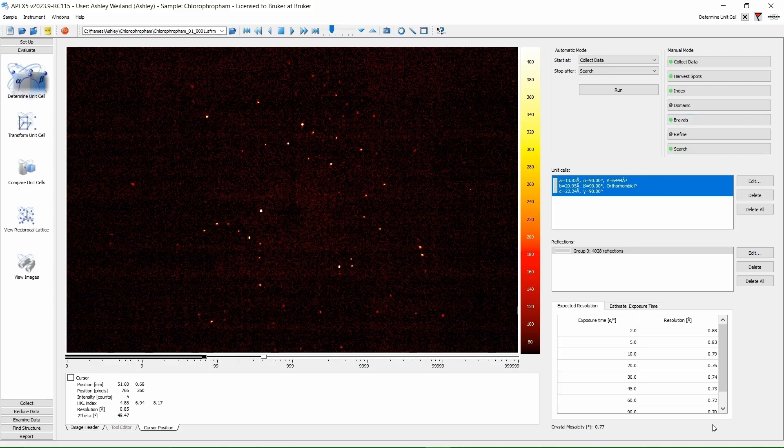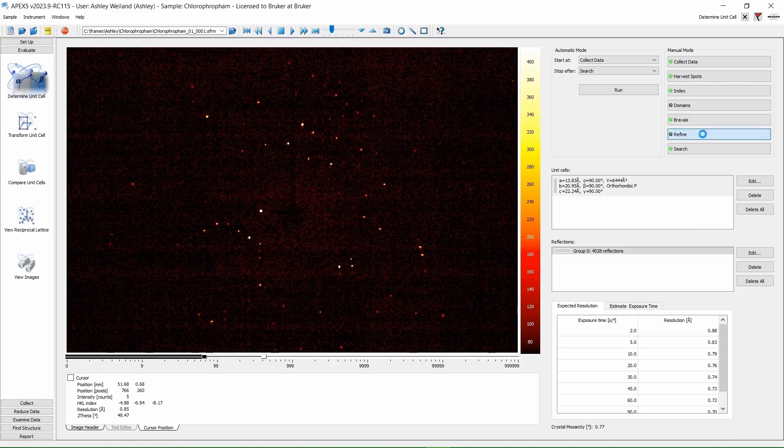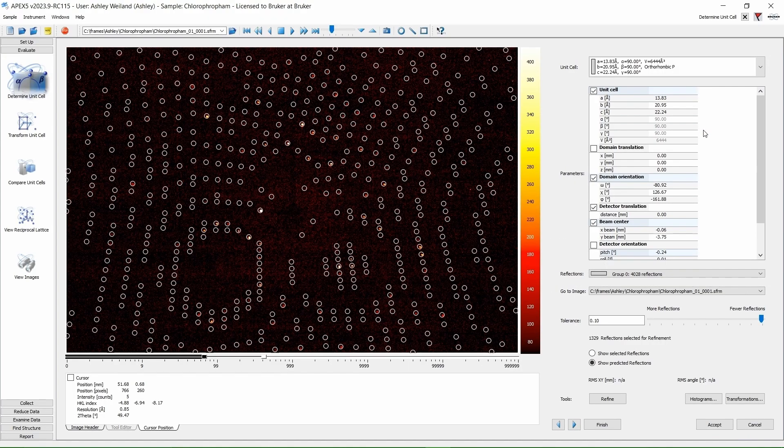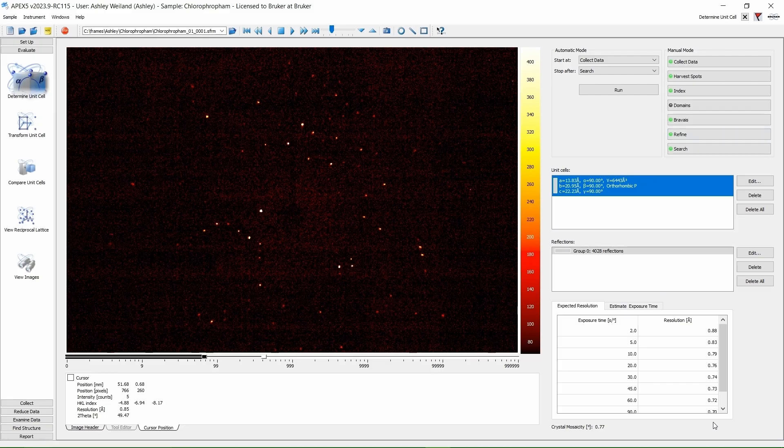Now that we have the constraints of the BraVe lattice, we are going to refine again. Click the Refine button. Once here, we will click Refine a couple more times. Click Accept. Now we have our unit cell.